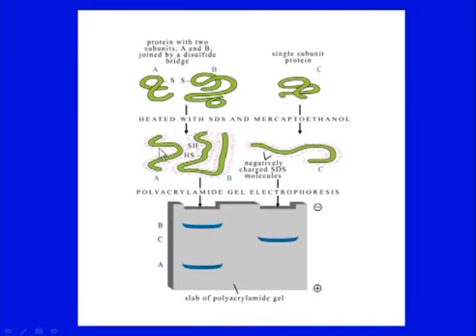Then a single protein, though made of two polypeptide chains, will be seen as two separate bands in the reducing gel. To know whether it is a single protein, you can always run non-reducing gels also. In non-reducing gels, the disulfide bridges will not be broken, as mercaptoethanol is not included in the sample buffer, and a single band can be obtained.